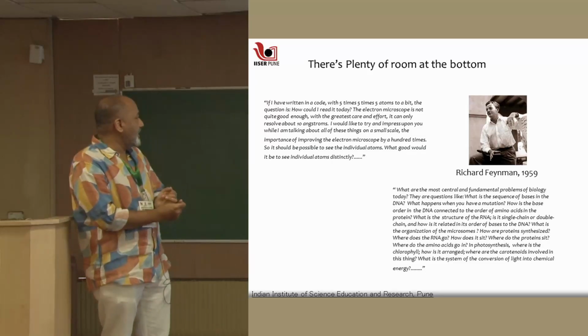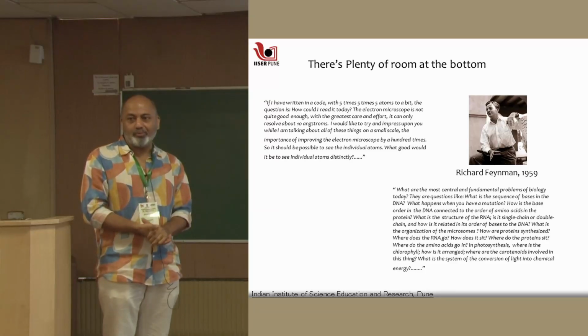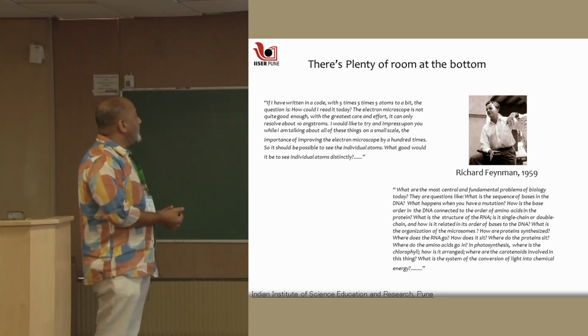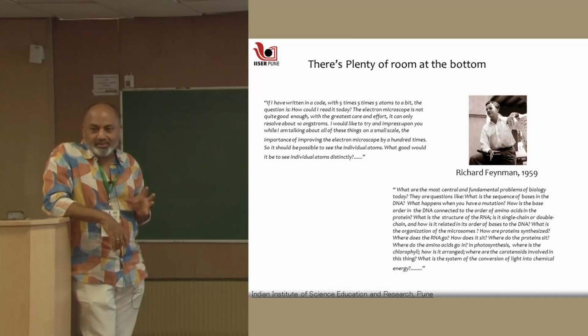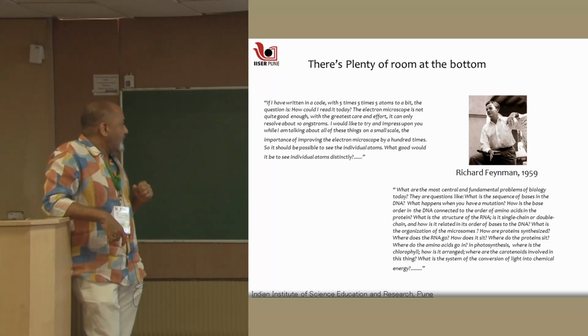The whole thing begins with a 1959 lecture by Richard Feynman. You, of course, all know Feynman, right? Famous physicist. And this lecture is titled There Is Plenty of Room at the Bottom. This is the lecture people always use for nanotechnology topics, right? A lot of physics at the scale of nanometers was discussed in this lecture. But I picked up 2 paragraphs which are of relevance to what we are going to discuss further today.